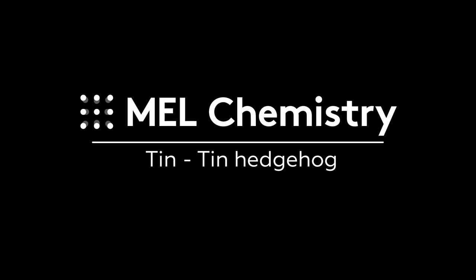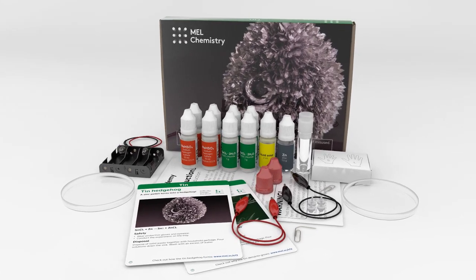Welcome to the wonderful world of chemistry. Today, with the help of the tin set by Mel Chemistry, we will make a tin hedgehog.